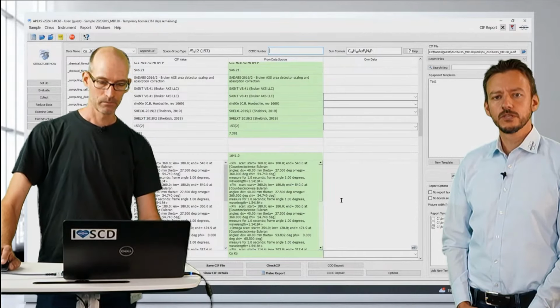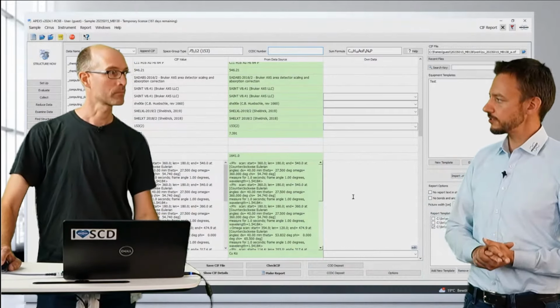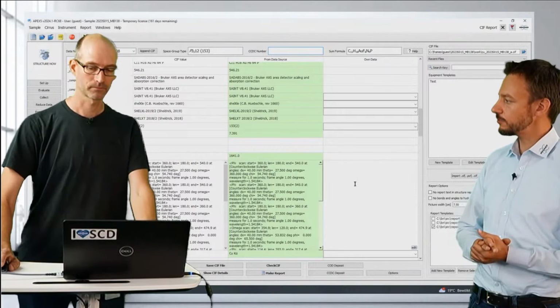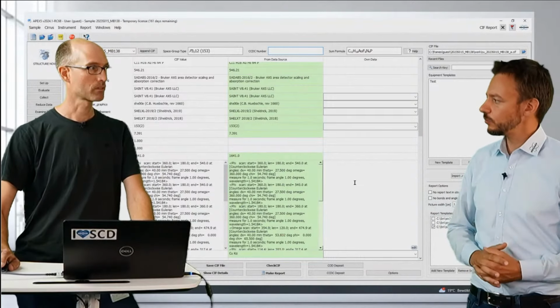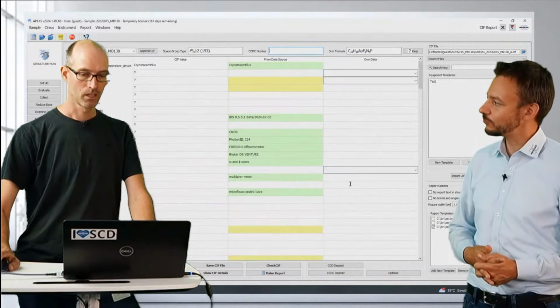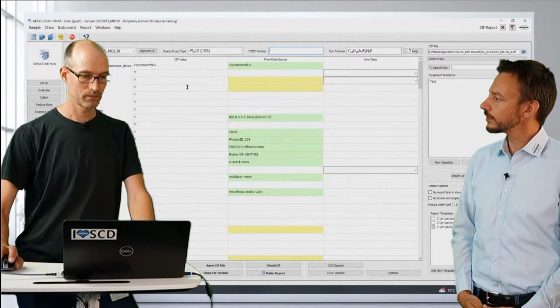And so, as I understood, then Apex just collects throughout the whole process all the parameters important during the structure determination, and automatically puts them all in there. Is that right? Yes. Oh, that's really cool. So if we go all the way up, what do I have to do now here? I mean, how many yellow fields are left? Not much.